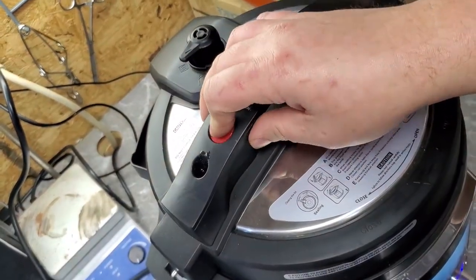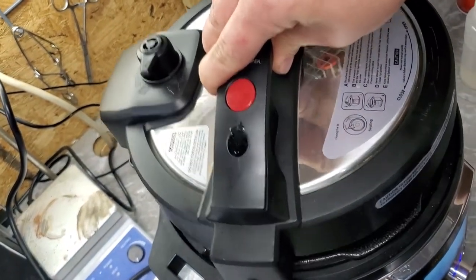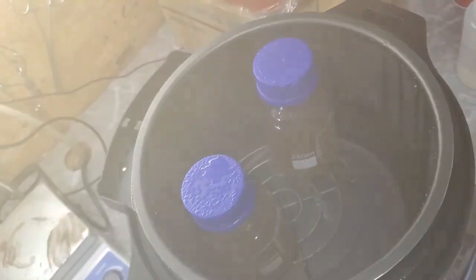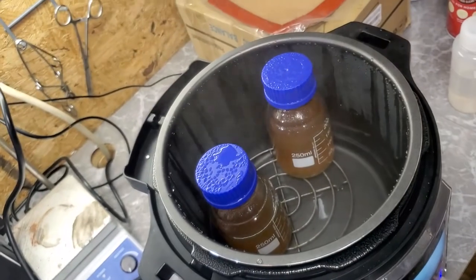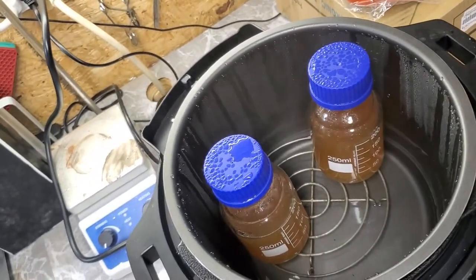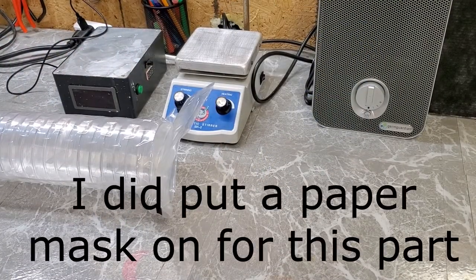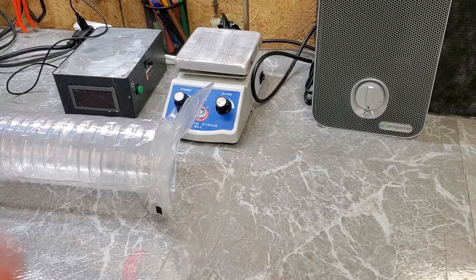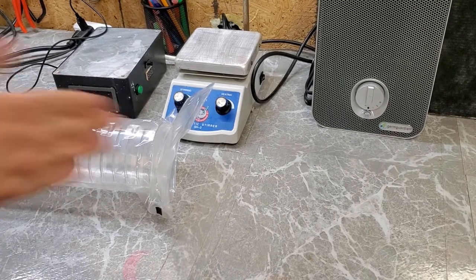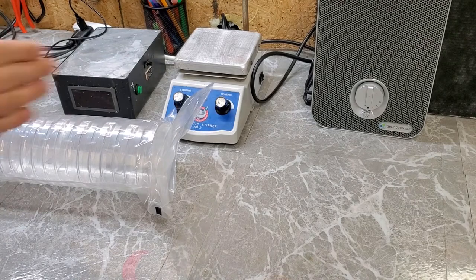Good — internal pressure has been released. I'm going to take these petri dishes out of their sterile sleeve. Let me sanitize my hands. I'm going to make four stacks of five petri dishes each.